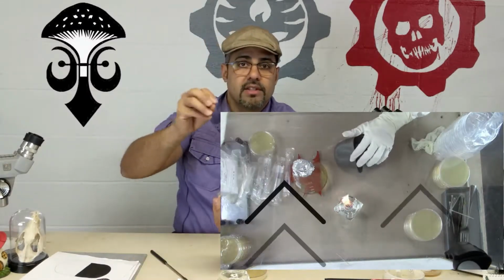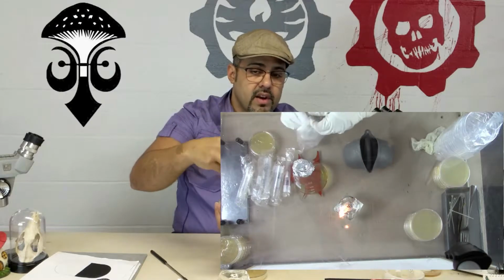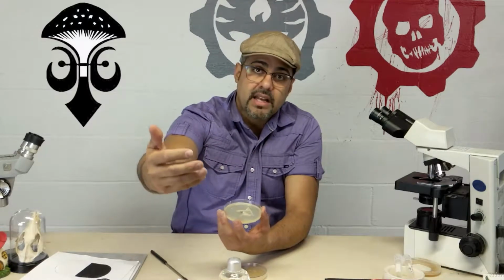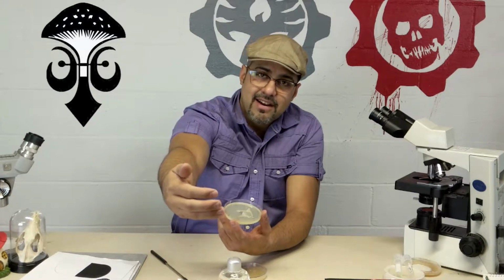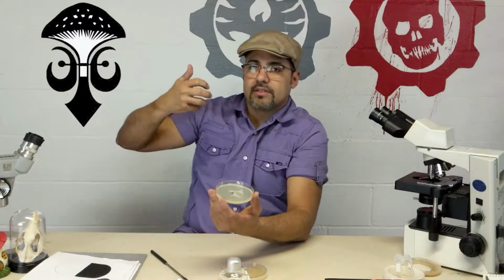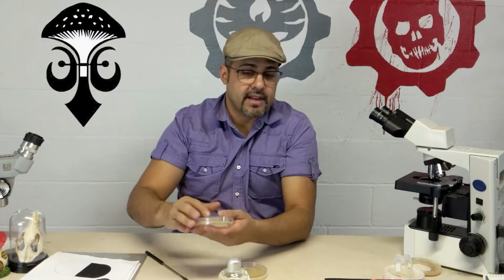Imagine that you have spores hanging around in the air, right? They will not go there because there's a flow of clean air that has been cleaned 99.9%, right? No bacteria, no spores, etc., so all the air would come this way. All right, so that's one thing.